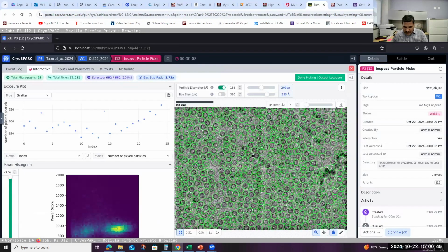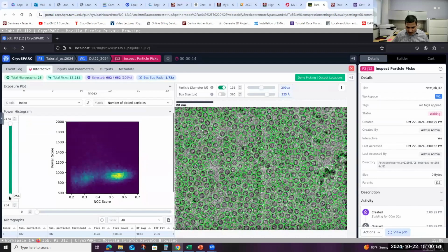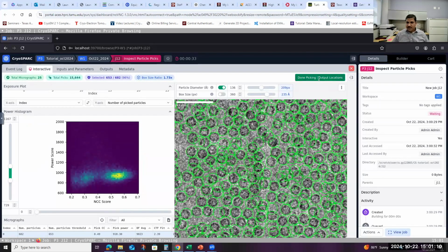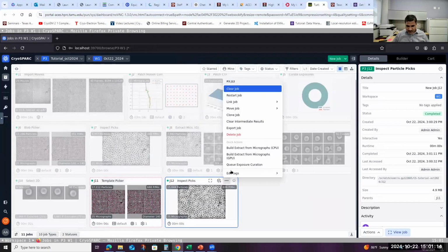Okay, you can see the part picking is way more centered as compared to the previous one. But again, we need to remove some, it might also pick up some from the background. So you can remove that one, and also from the black area, and that's what I need. Okay, select yes, done. Okay, now we do the same thing again.